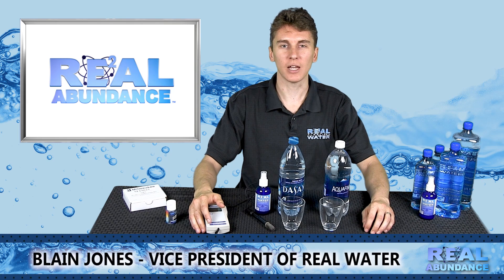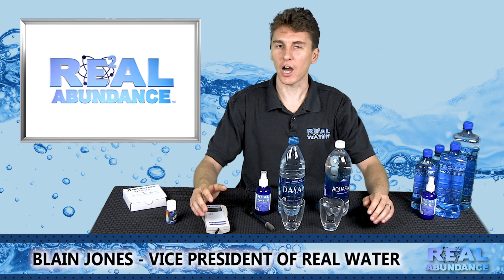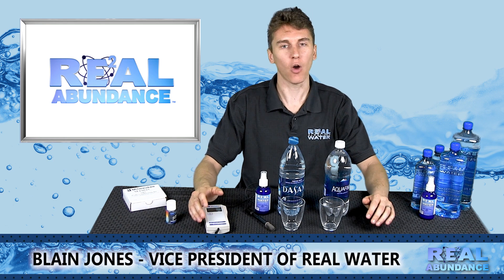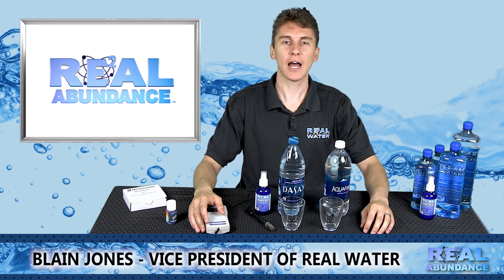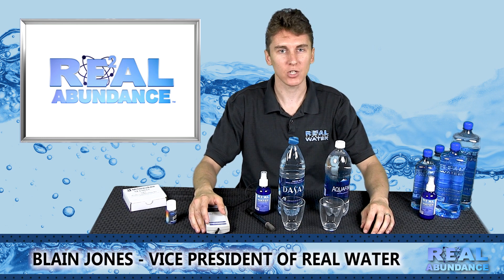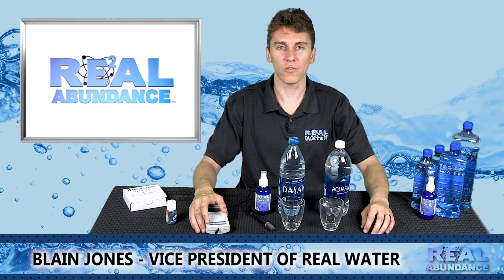Hello, my name is Blaine Jones and I am the Executive Vice President of Real Water. I have done hundreds of product demonstrations over the last few years and I would like to take a minute to show you how to properly demonstrate the pH and Oxidation Reduction Potential, or ORP, of the Real Water E2 Concentrate product.